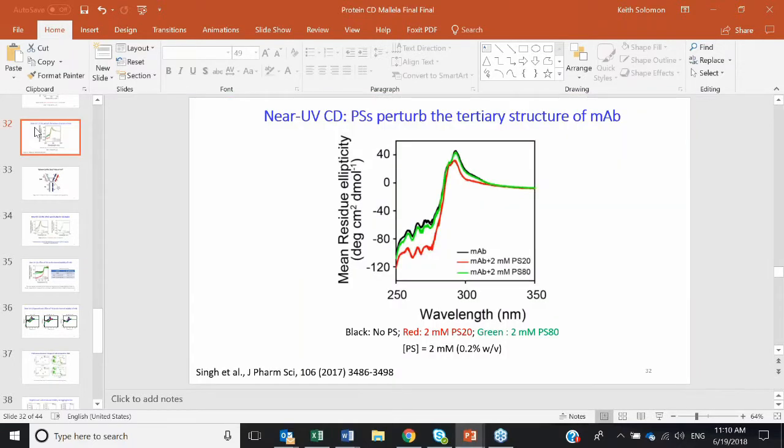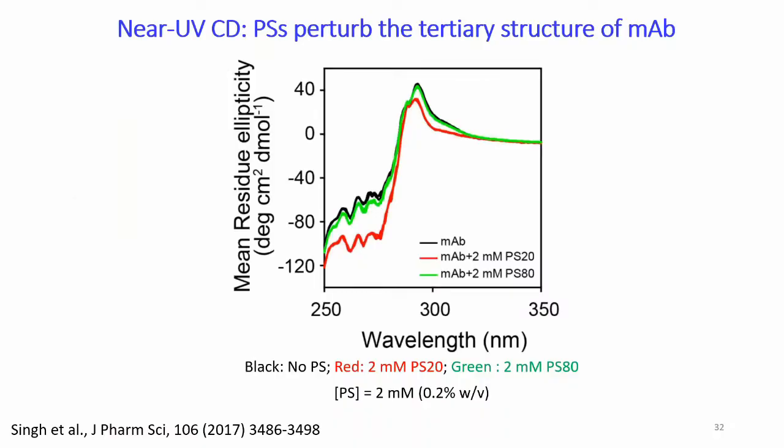Here, what we are showing is that there are 3 curves for each sample. Black has 3 curves, green has 3 curves, and red has 3 curves. Within the same sample, the variation, as you can see, is very tight compared to between samples. So we use something called the weighted spectral difference, which was developed by John Carpenter and John Gabrielson.